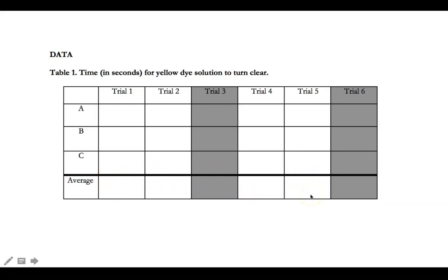It's really important in science that when you do an experiment that you run multiple replicates. 3 is actually a really small number. If we were going to do this for better data, we would want to run more trials. We might even do it in something like a 24-well plate where we could do 20 trials or something at once, and maybe have a team of folks who were watching it so that we could get all the times on all of those. Anyway, the more data points you have, the stronger the data. So we only have 3 for each trial, but it's better than 1.